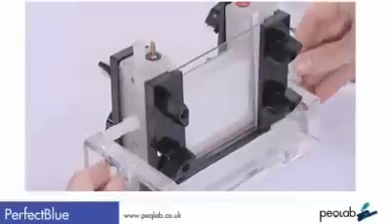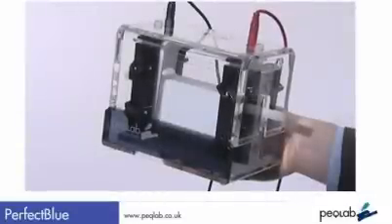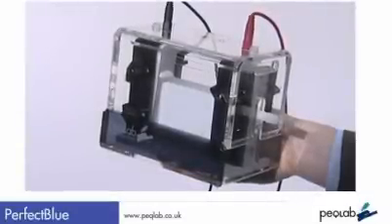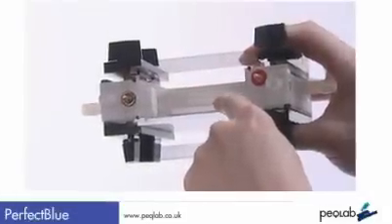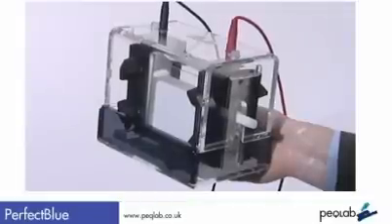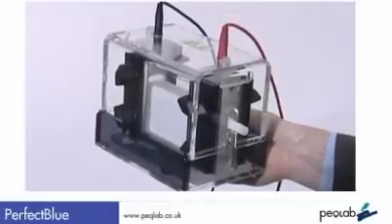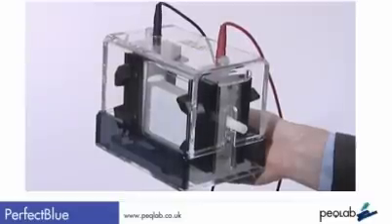So back to the system. The Perfect Blue Vertical system is equipped not with two, but three cathodes, which we believe gives a more uniform sample separation. The anode is protected in the base. The systems have centrally positioned ceramic bodies for efficient water cooling. This combined with the oversized upper buffer chamber provides optimal conditions for band separation without band smiling.